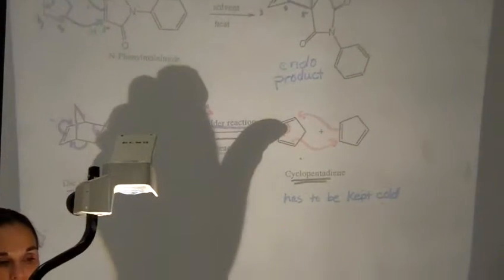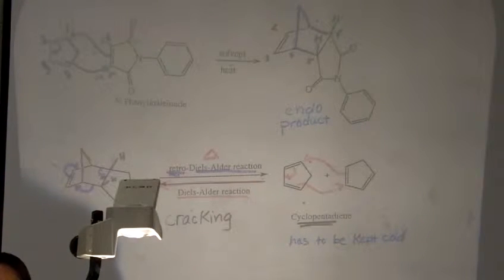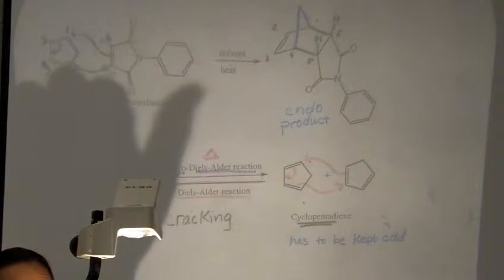And so this is the structure of the product for the reaction that you're going to be doing this week, okay? And this reaction works really nicely, really quickly. You're refluxing for 10 minutes. That's how good a reaction it is, okay? So it wants to go zippity-skippity because it's set up to react really well with each other. And basically all you've got in here are your 2 reactants, and you've got your ethyl acetate solvent. That's all you need to get the reaction to go, all right?